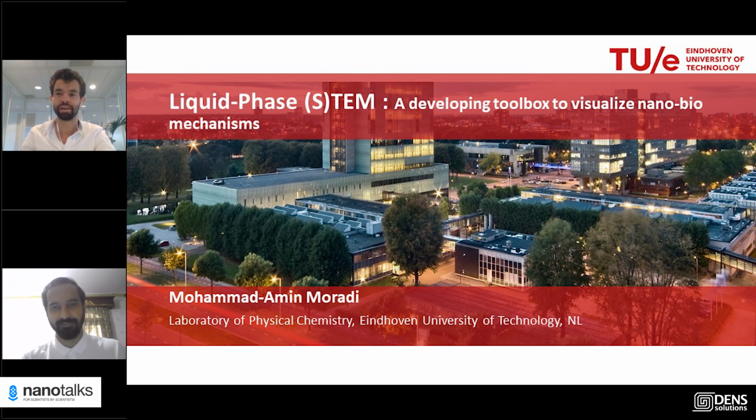All right. Mohammed, I have one last follow-up question from Ahmad. Ahmad, thank you for your first answer. He says, in the polymer cases, how can the beam damage affect the dynamics and chemical reaction there? I'm not sure if I understood the question. The question is about the beam damage on the polymer, how the beam damage can affect the dynamics and chemical reaction, the beam damage on the sample.